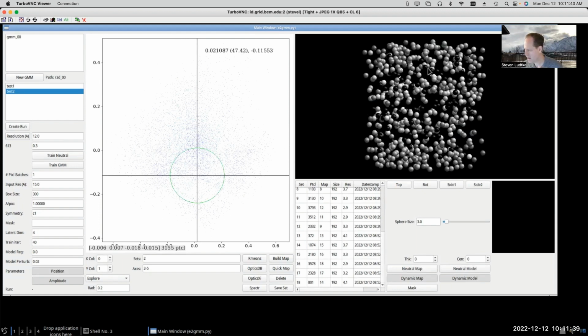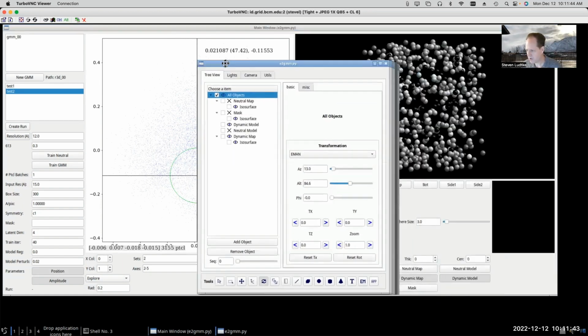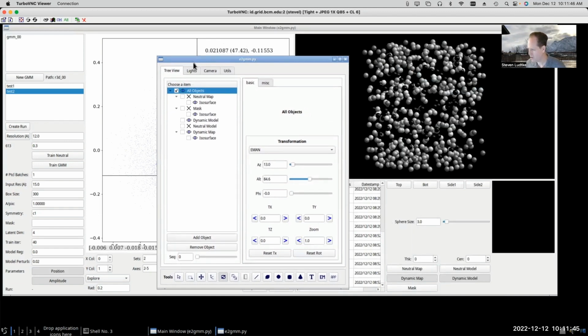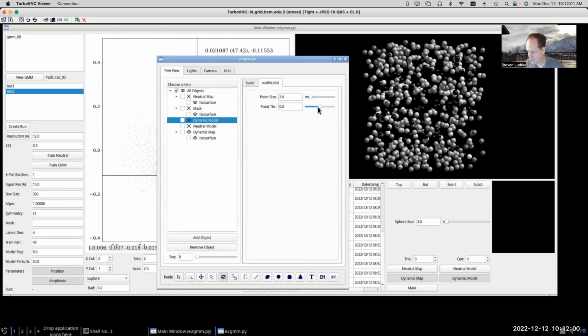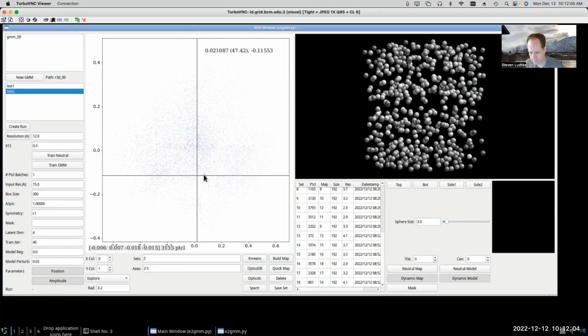Now you notice the black spheres don't really move very much. That's because they have basically 0 density. They're mostly there as kind of placekeepers to permit things that are moving to be detected well. So you don't really expect them to move. So I might actually go in here in the dynamic model and adjust my threshold so we don't see those kind of visual distractions.